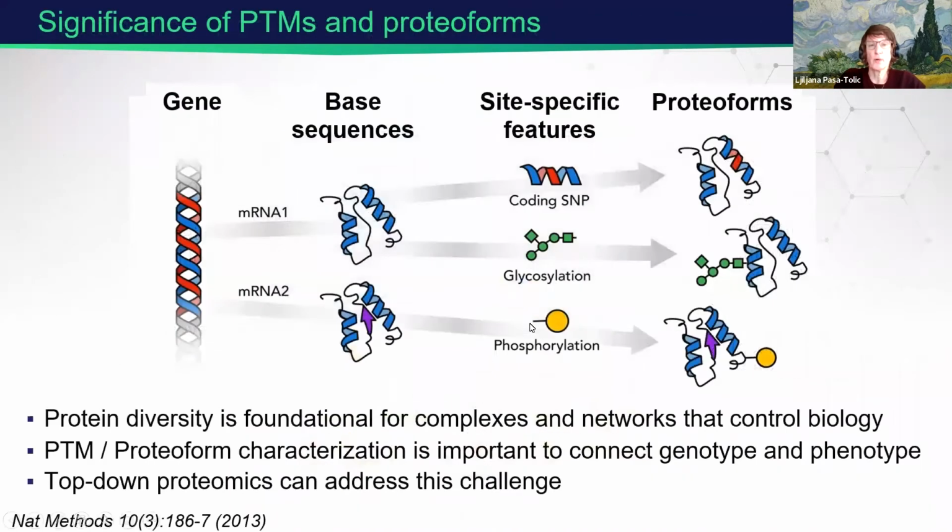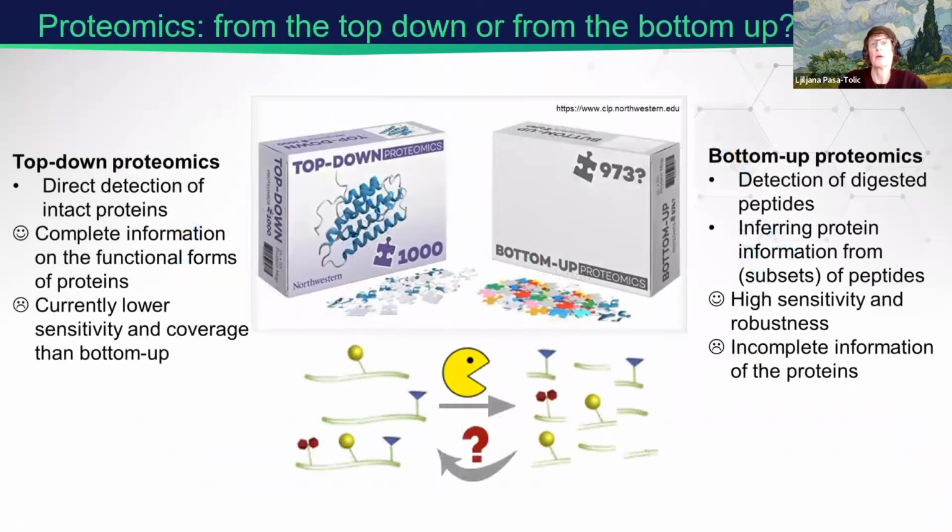So as you all know, proteomics is typically done using what we call bottom-up approach. So by digesting proteins into peptides, typically using something like trypsin, and then analyzing these peptides using some mode of chromatography coupled to mass spectrometry and searches against known genome information. So in this approach, we use peptides as a proxy for a protein, and it is an extremely powerful approach where we can very quickly characterize a good portion of a proteome, say 10,000 proteins from a human or something at that level.